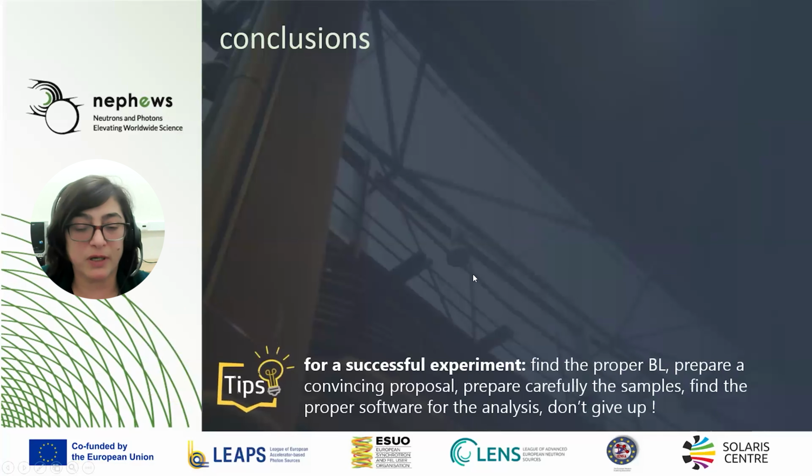Now, to close, some tips for a successful experiment. Find the proper beamline. Prepare a convincing proposal. Prepare the samples carefully. Always bring more samples to the beam time. Find the proper software for the analysis, and don't give up.